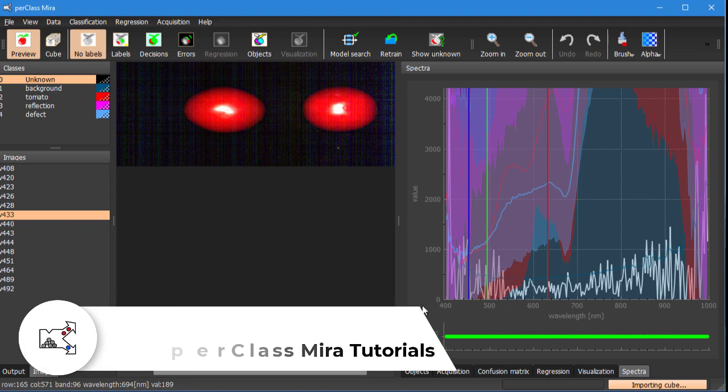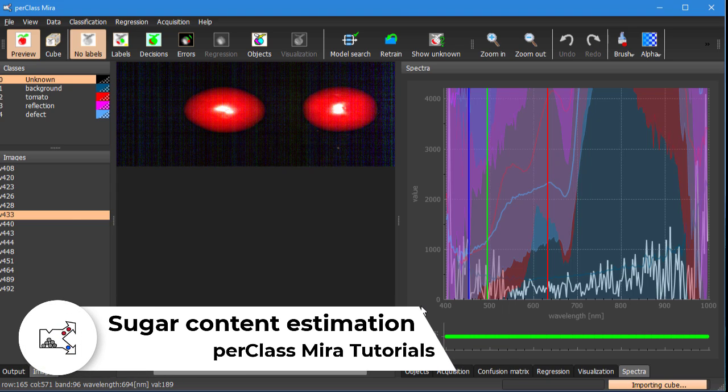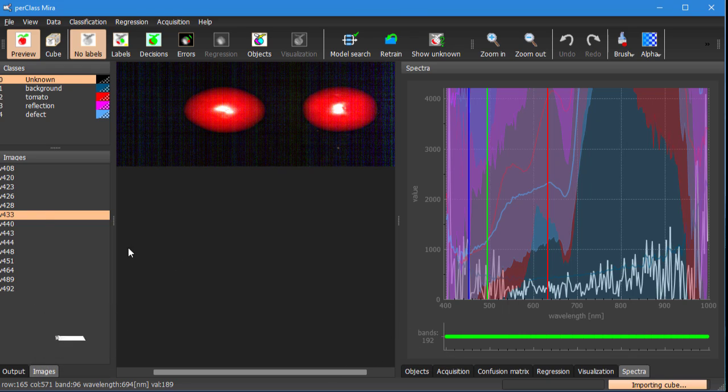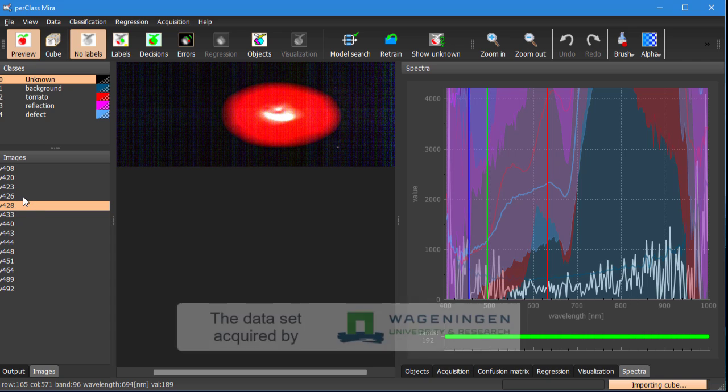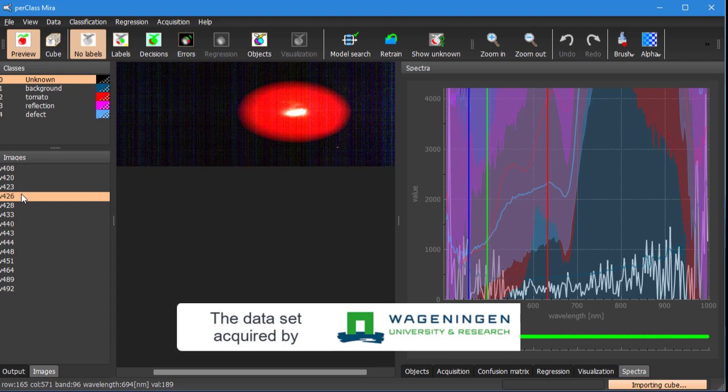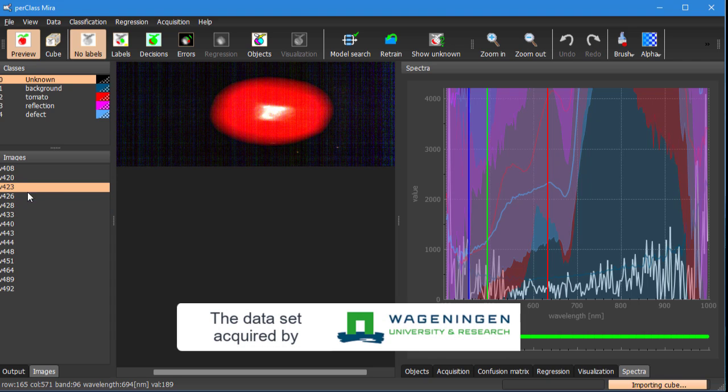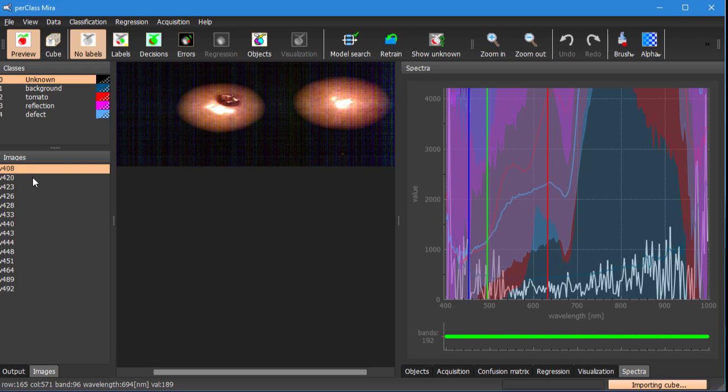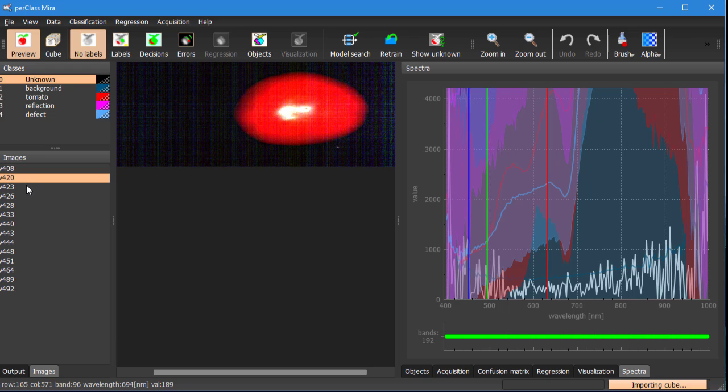Hi, in this tutorial I want to show you how to estimate sugar content in tomatoes using spectral imaging. In this project we have a set of scans acquired by hyperspectral camera. You can see that each contains one or more tomato pieces.